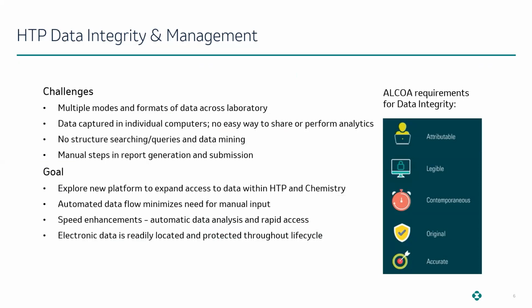So here at MSD, we follow the ALCOA requirements for data integrity, where data needs to be attributable, legible, contemporaneous, original, and accurate. And rapid data access and automated analysis will ultimately help accelerate research goals. And data quality will be maintained and protected throughout the life cycle.